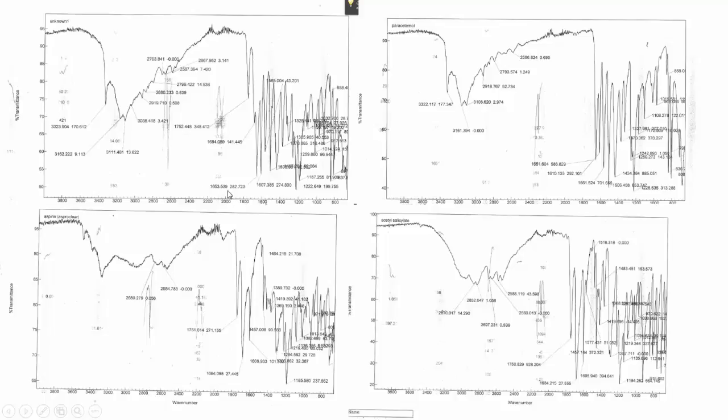By using the same method of identification, it was determined that acetyl salicylate was also present in the unknown compound. The peak at 1684 corresponds to an ester bond, which is also present on the characteristic IR spectra of acetyl salicylate. Finally, a third analgesic was identified in unknown 1, aspirin.